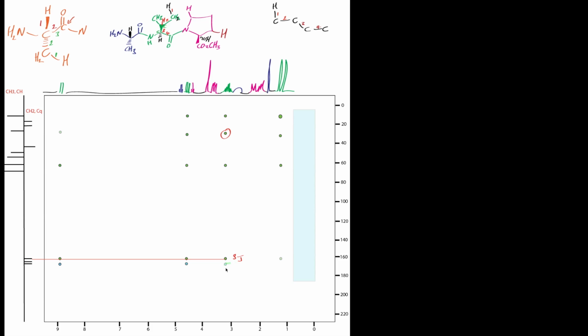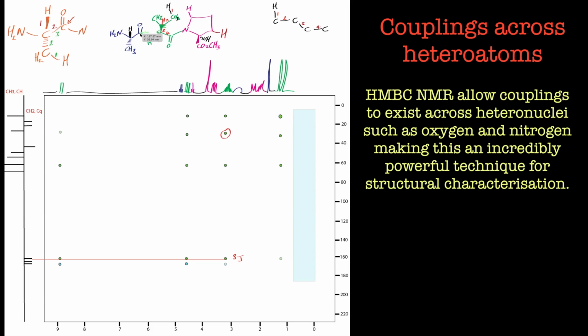Now if you look, there's a bit of grey there for the alanine carbon, actually. That's the bottom one, and that's because if you count the bond correlation there, the proton to the carbon is 1 bond, then to the alpha carbons are 2 bonds, and now you go from that alpha carbon to the nitrogen, that's 1 bond, and you can go through heteroatoms and you should be able to see that as a 4 bond correlation. Now, like I said previously, that would be weak, so I've grayed that out because you might not see that. But if we go on to the alpha carbon here, and let's just clean this up because it is getting a bit messy. Just get rid of that a second.